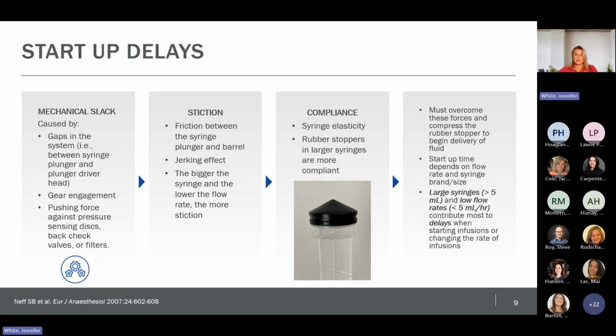Now let's talk about startup delays. Startup delays are influenced by mechanical slack, stiction, and compliance. Mechanical slack is caused by any type of gap in the syringe pump system.